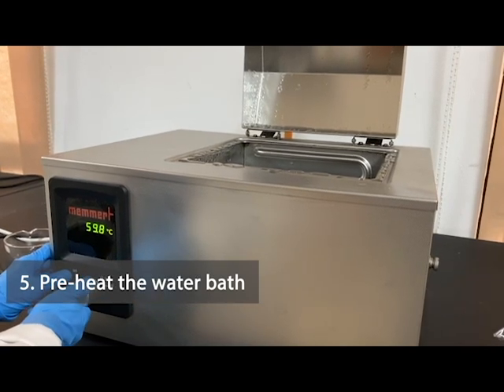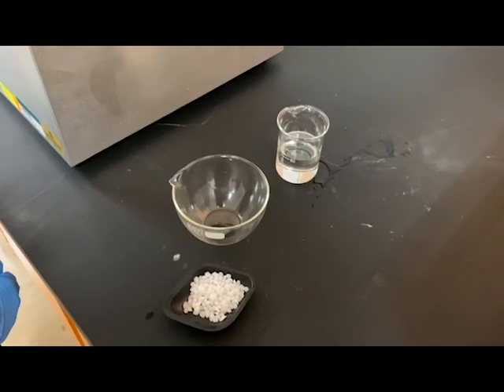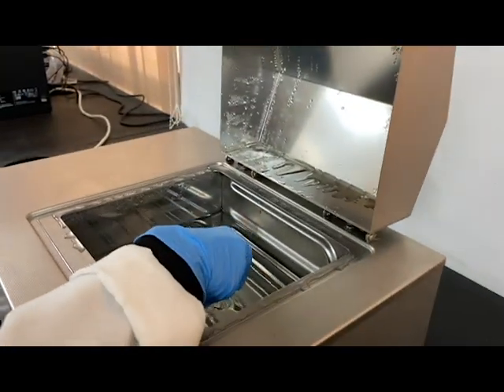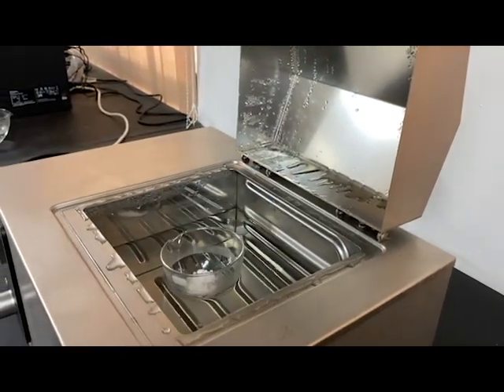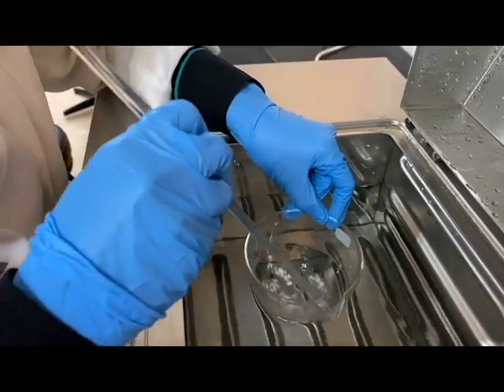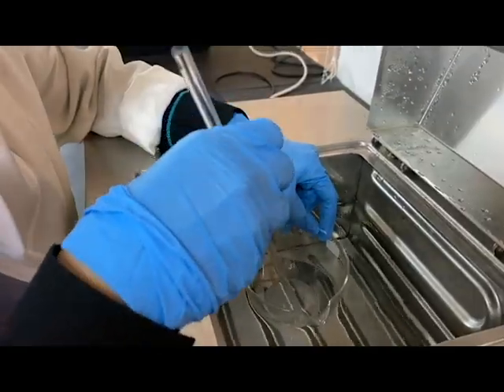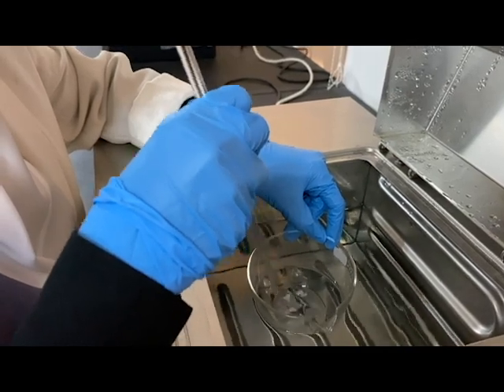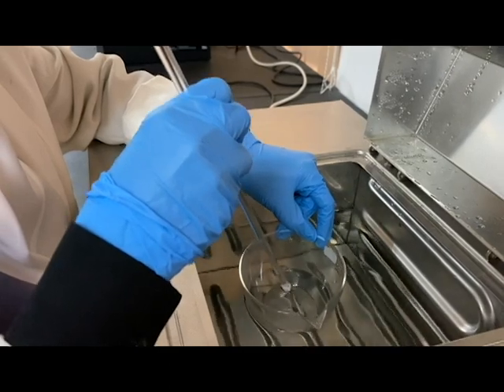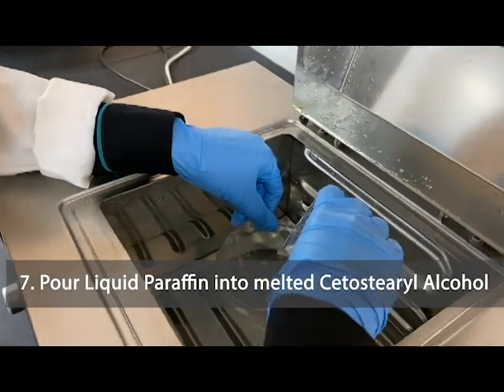Melt the Cetostearyl Alcohol. Pour the Liquid Paraffin into the melted Cetostearyl Alcohol.